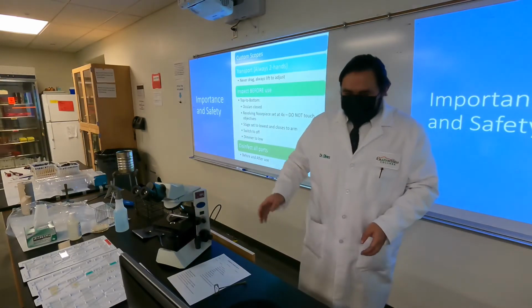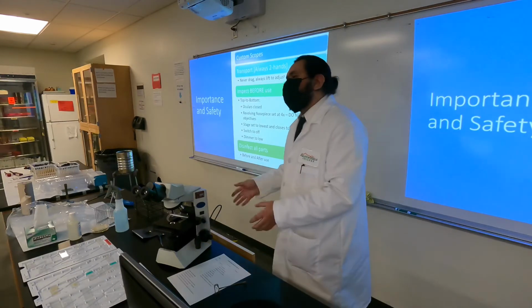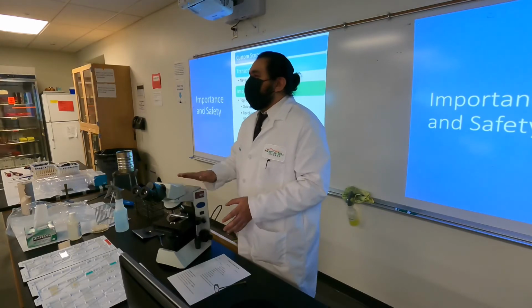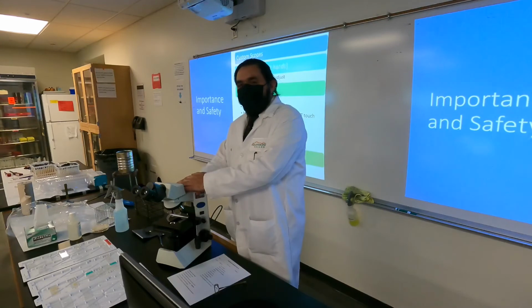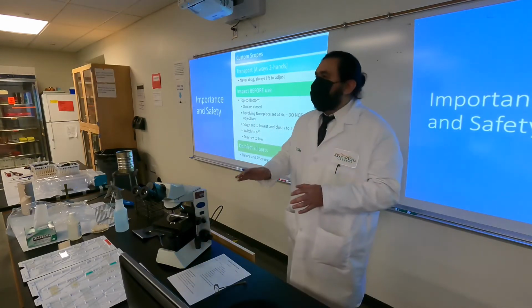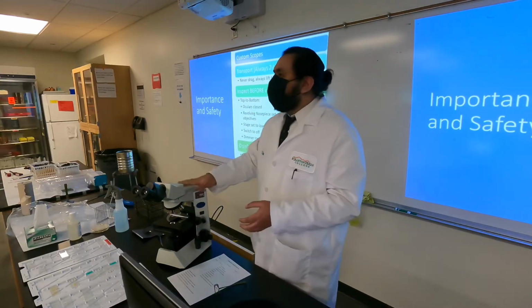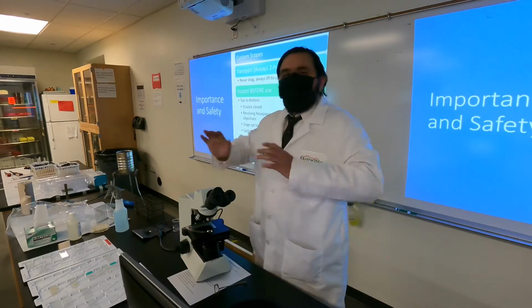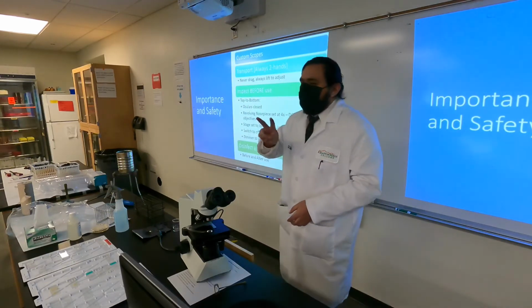Okay, so the other thing is that you're going to want to adjust it where you sit. Some of you will like to have the scope standing, some of you will like to sit. No big deal there, but you're gonna want to find a happy spot for it. Once you do, do not drag it. It has rubberized bases that if you try and yank it, it'll rattle the whole mechanism, and guess what? You owe me a new car or possibly a new baby. So either way, always lift it. Doesn't matter how many times you lift it, enjoy it. Find your happy spot 10 times if you want to, but always lift and always with 2 hands, okay?